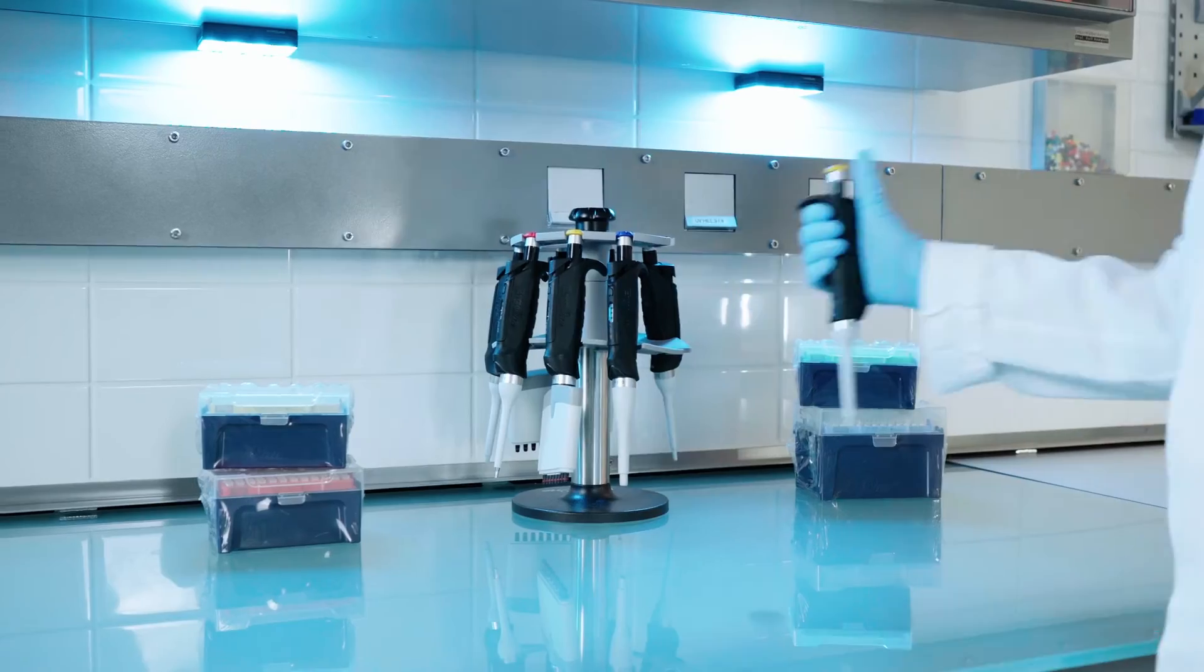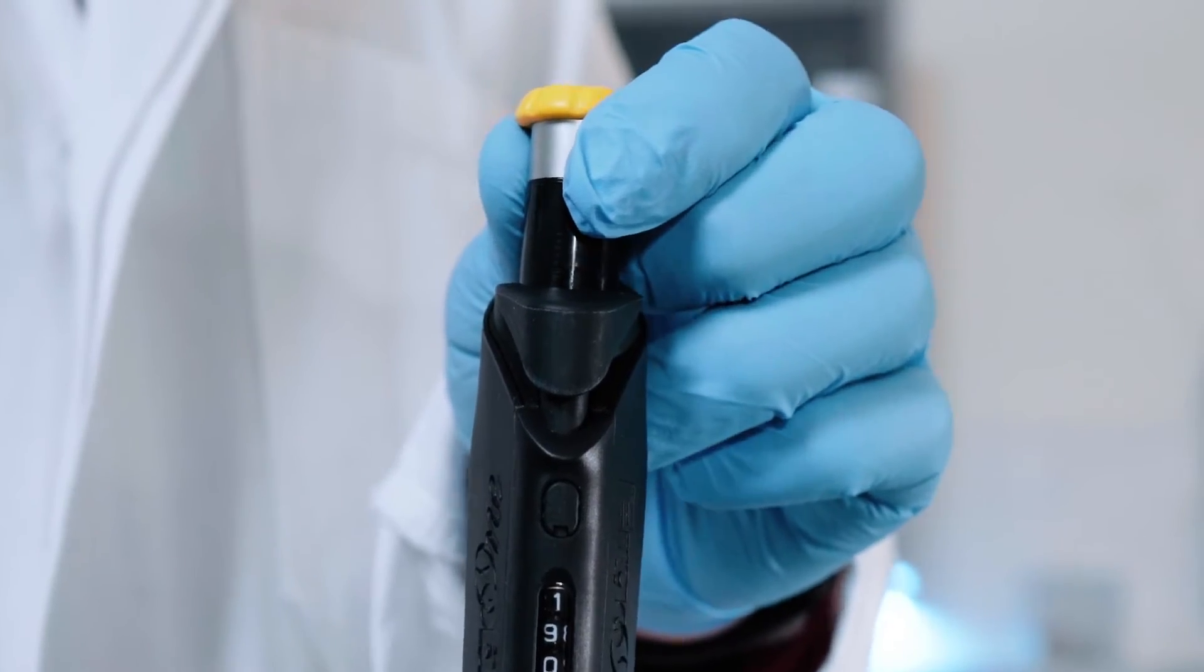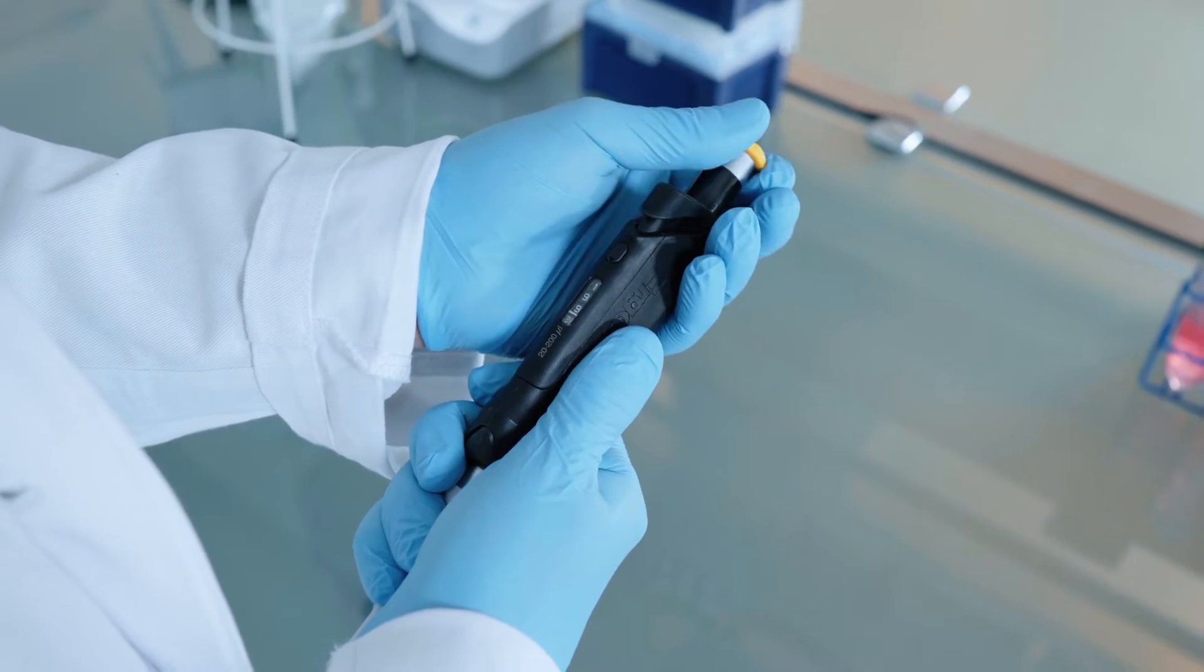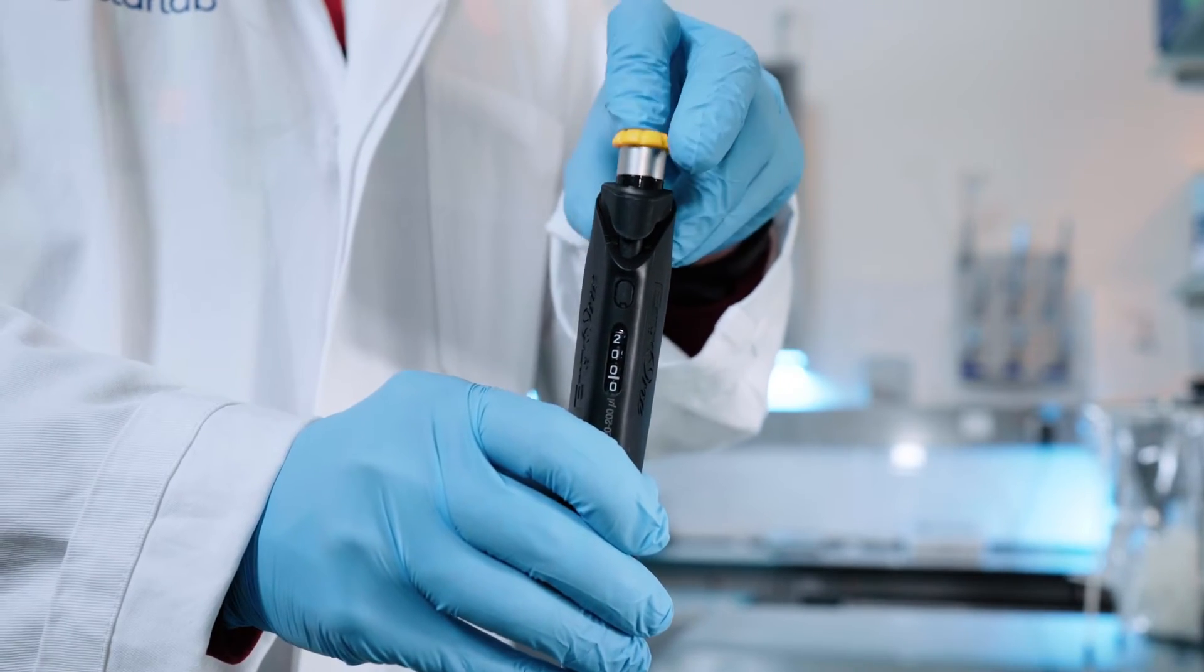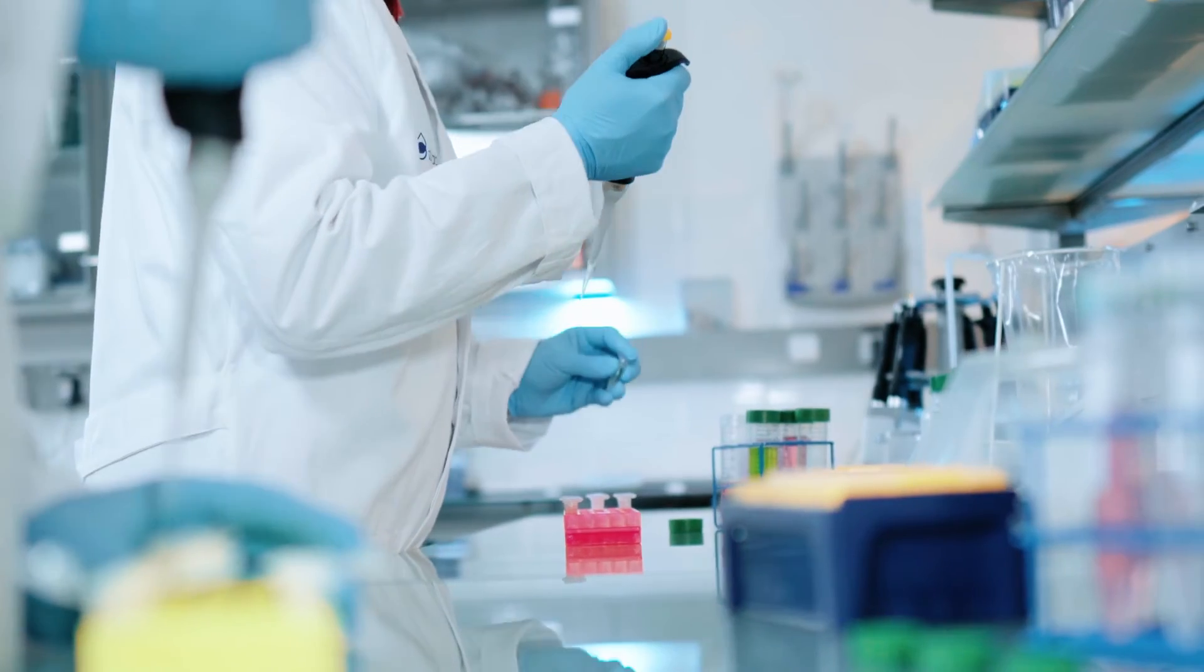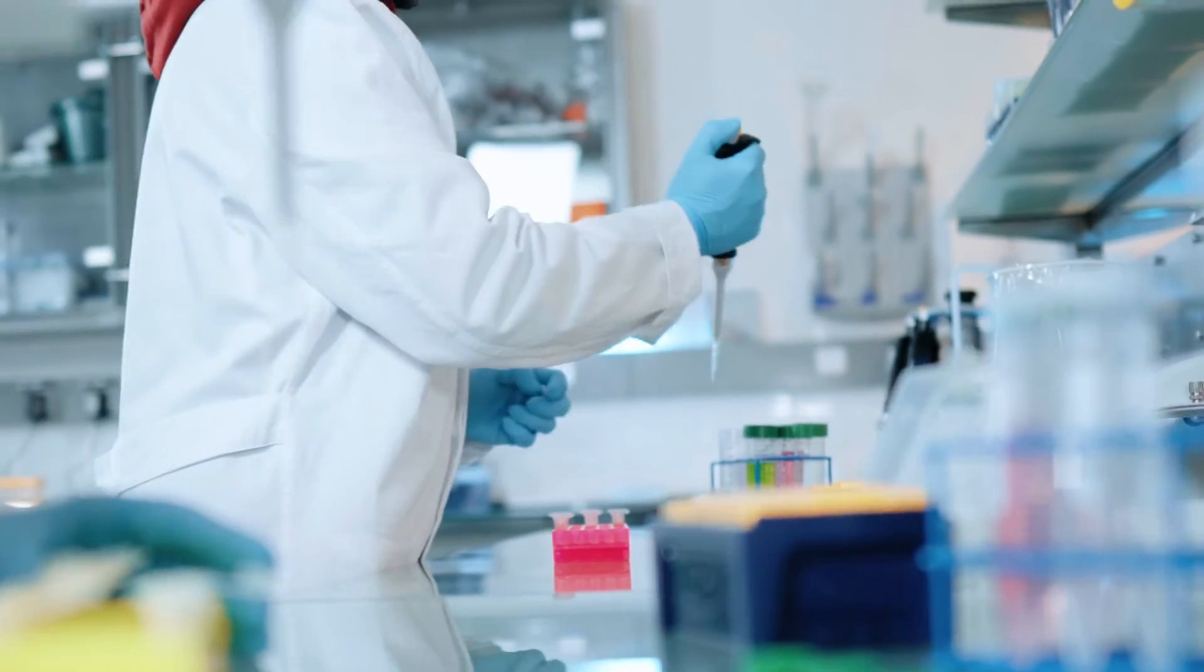Operating the pipette is also as easy as can be. Simply pull up the plunger and turn to set the volume. Then push the plunger down to activate the volume lock, so you can keep pipetting without worrying about the volume drifting.